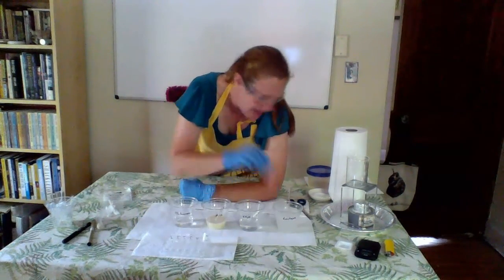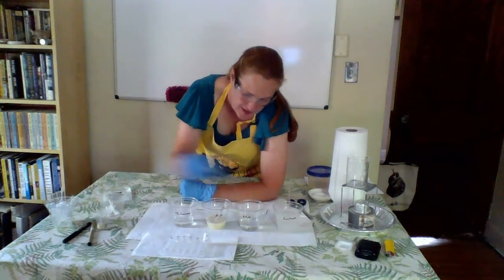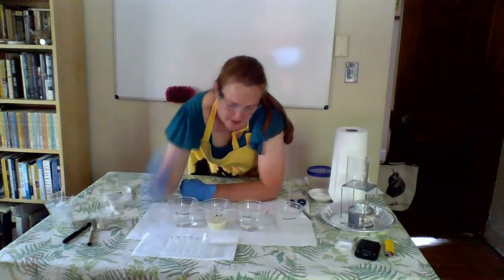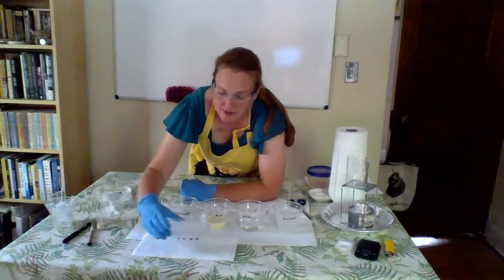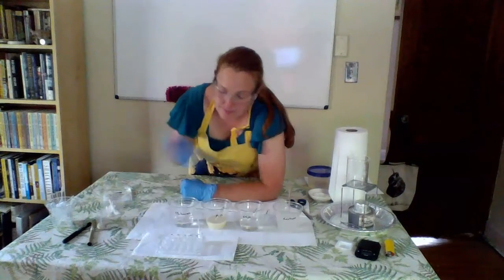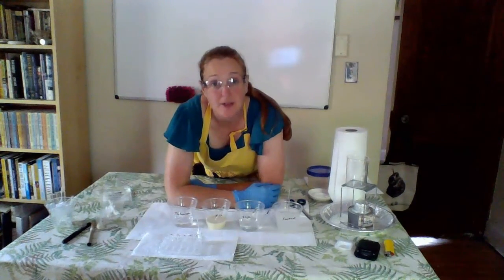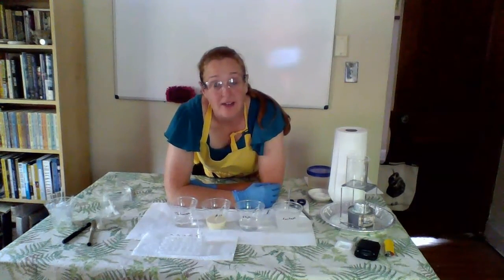And then I'm going to add my distilled water to well E. Now I want to give this just a little bit of a shake. Try to make sure that everything gets mixed up. The next thing that I'm going to do is let these sit for 5 minutes. After 5 minutes, I can then test with my strips to see whether or not I have any glucose.